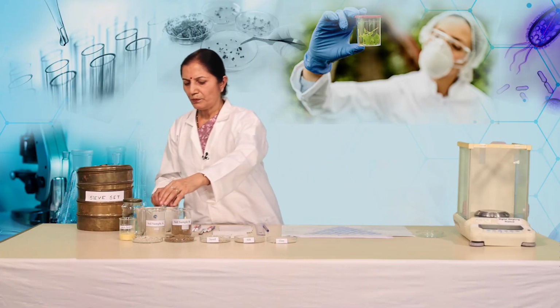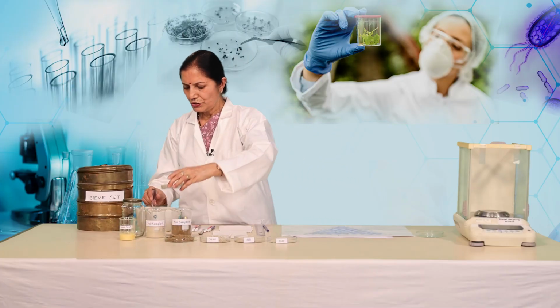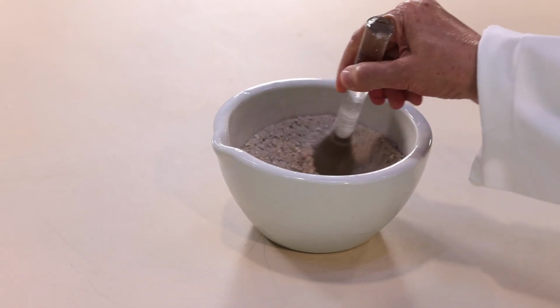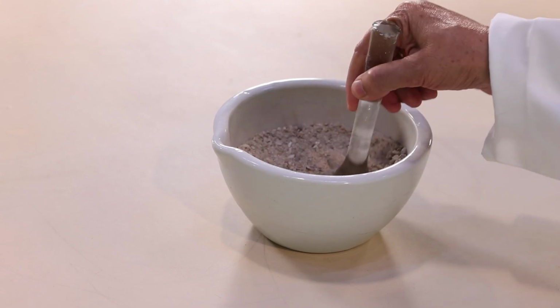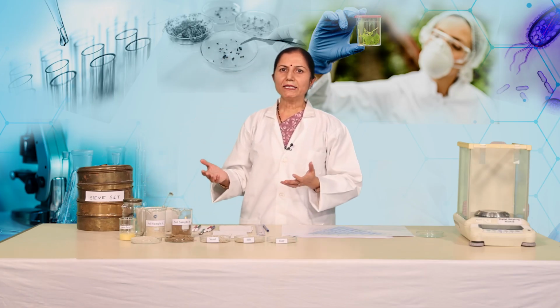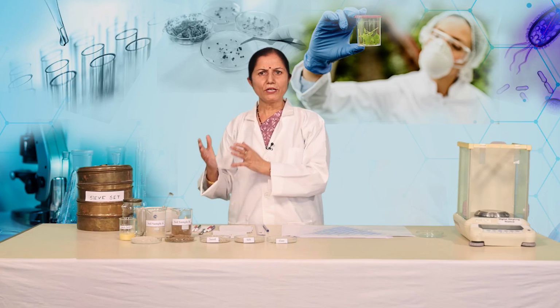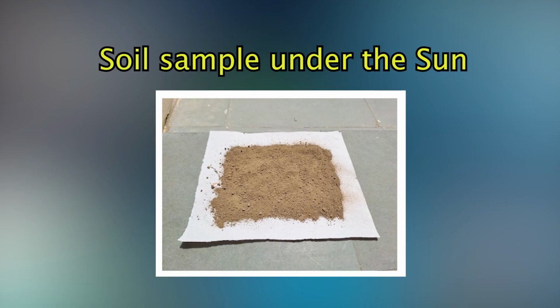Then break the lumps of the soil using pestle and mortar. After this, dry the samples in an oven at 80 degrees Celsius or on a stove, or by spreading these under the sun to remove the soil moisture or capillary bound water.